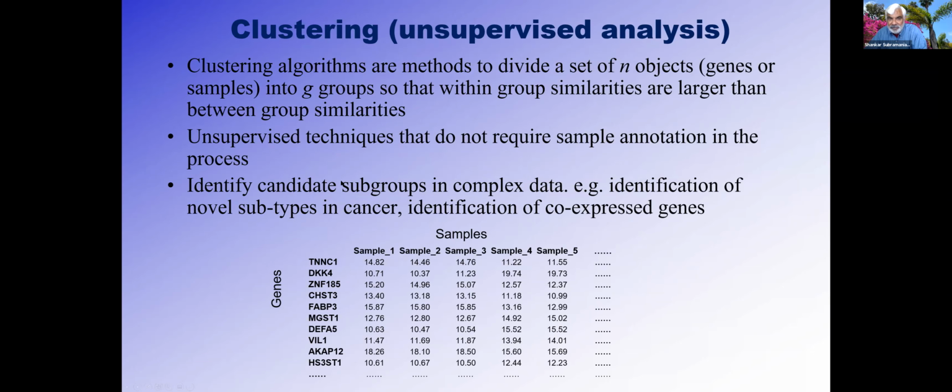Clustering comes in many ways. There is supervised clustering and unsupervised clustering. Unsupervised clustering means that you don't know any biases a priori. You just say, okay, I'm going to group these according to some measure of Euclidean distance between these things, right?